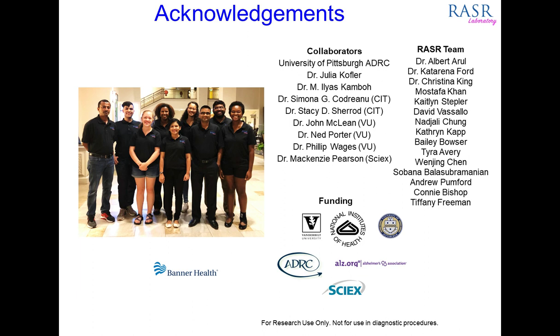Now, how critical is the MS platform to the quality of the data presented for the proteomics work? Oh, it's very critical. Hopefully I was forthcoming in the data that we showed throughout, showing the evolution of the quality of the data that we got from Velos and Elite platforms compared to Fusion Lumos platforms. The mass spectrometer plays a big role because the performance of the mass spec by way of sensitivity and duty cycle and how fast you can generate different scans is very critical to being able to get as much data as you can, but also as much data of good quality.